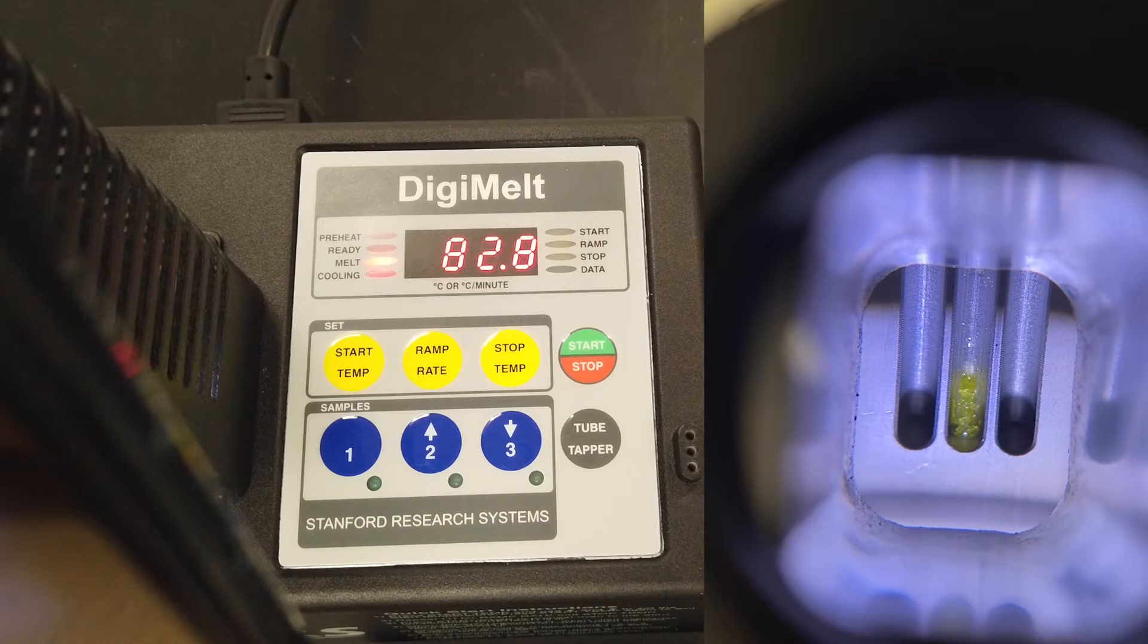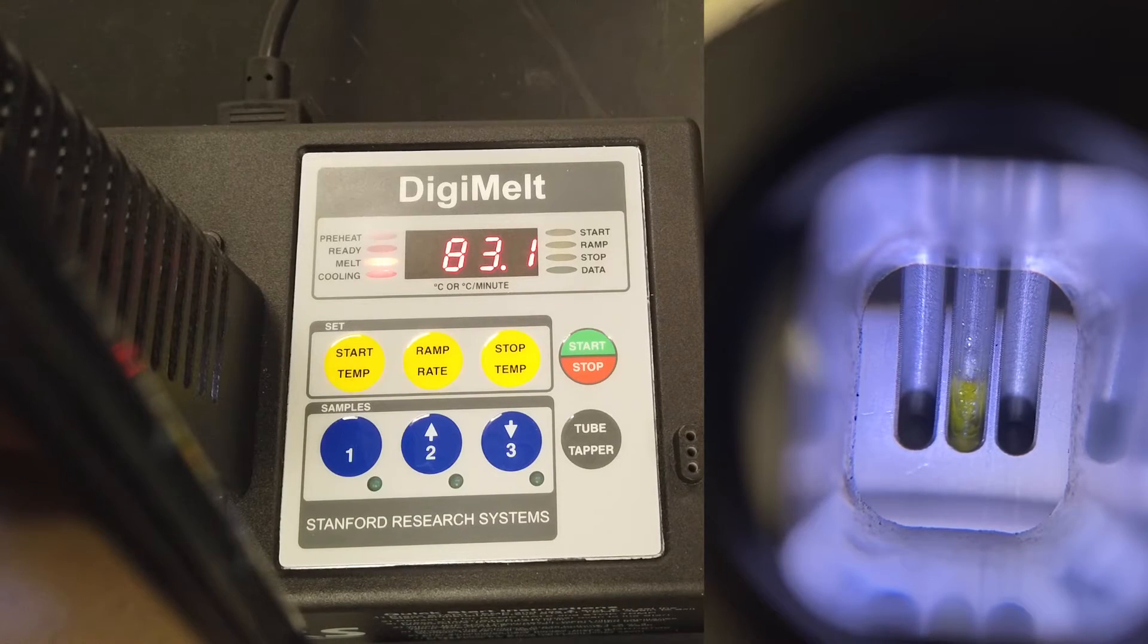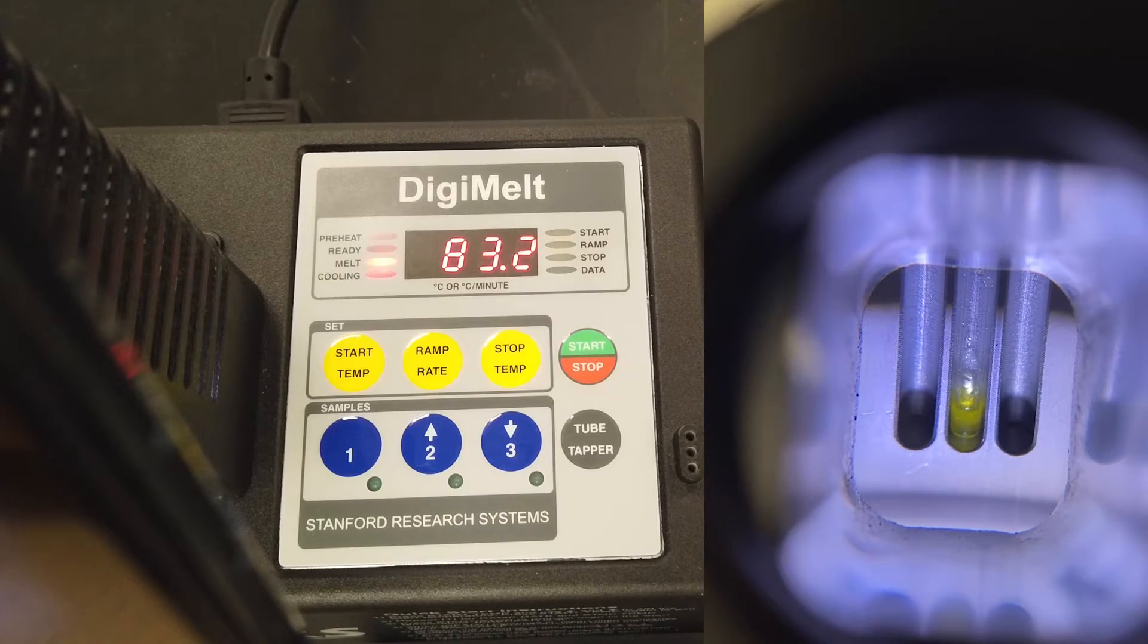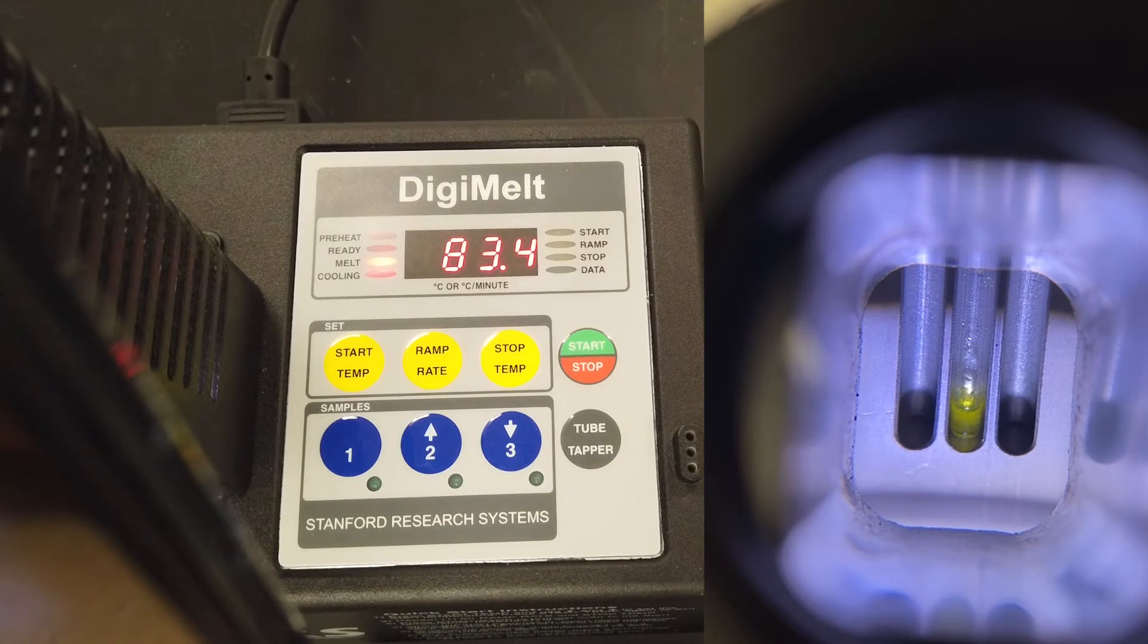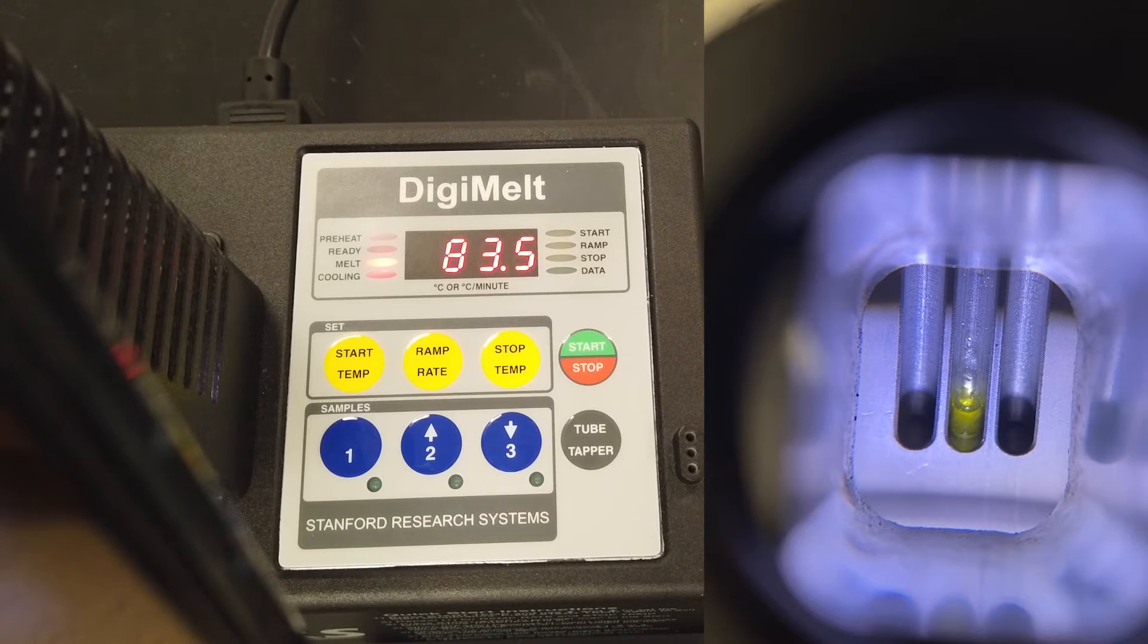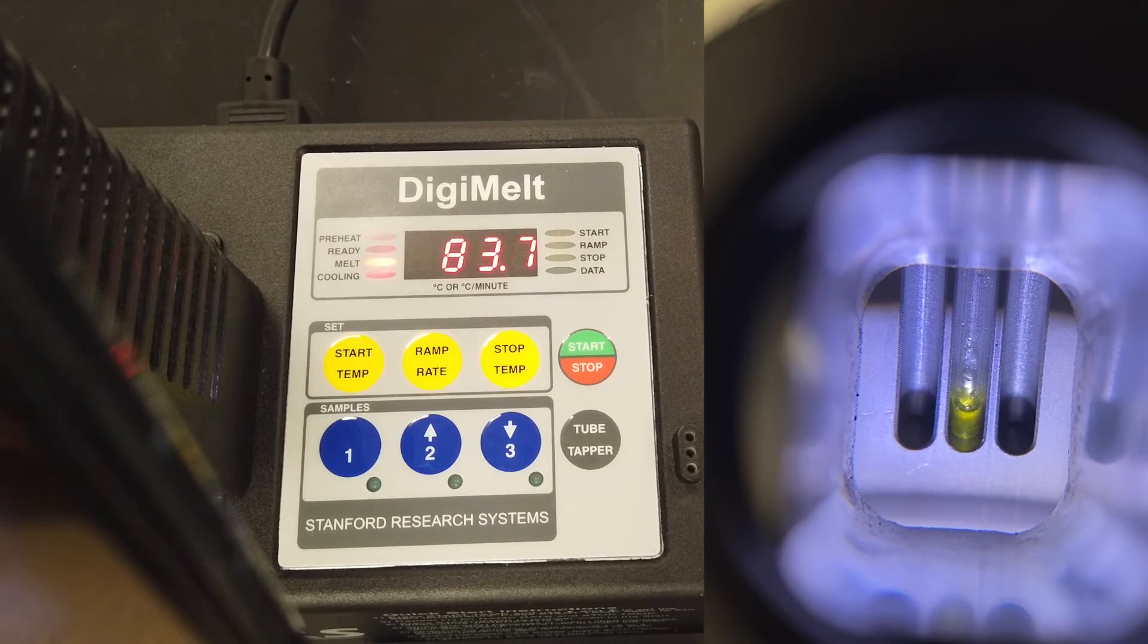Here we can see a relatively pure substance begin its melting point at around 82.2 degrees and finishes melting around 83.5 degrees. This indicates a relatively pure sample.